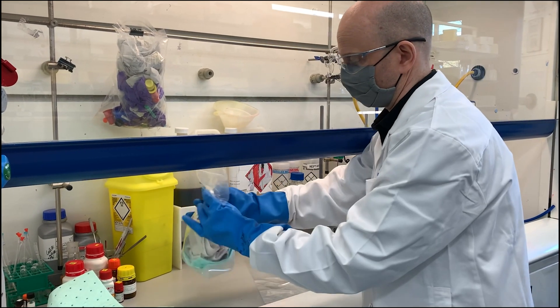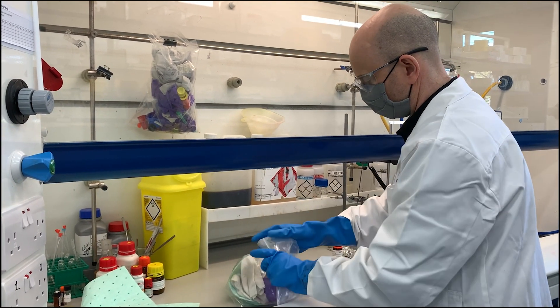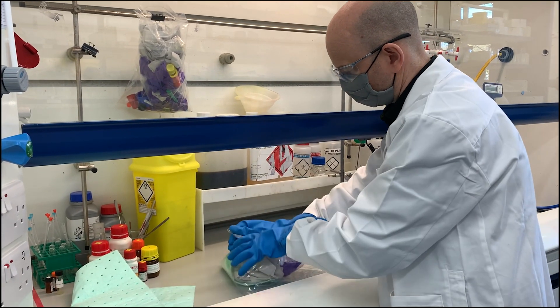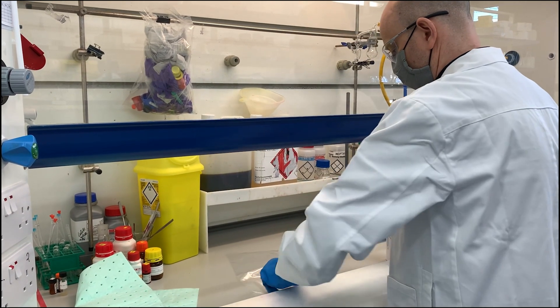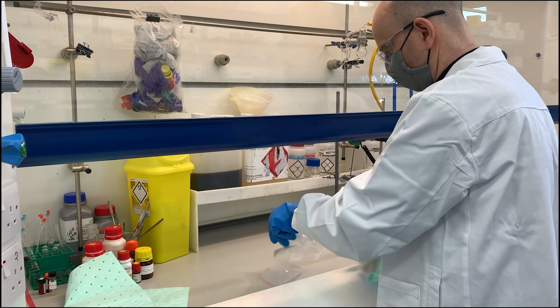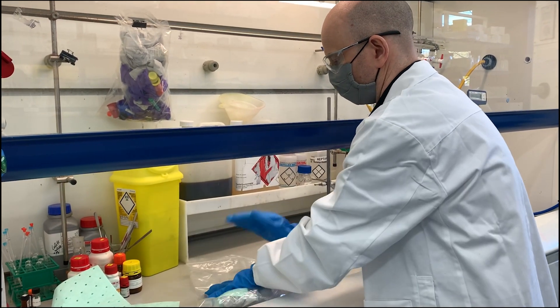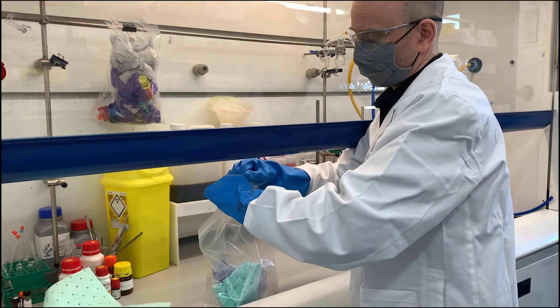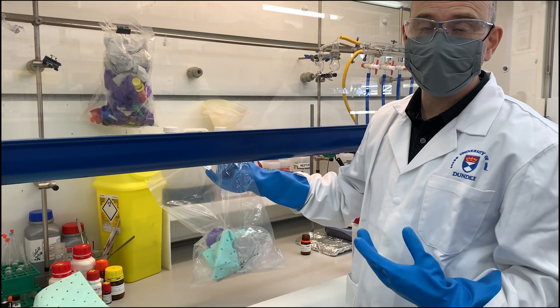This waste bag needs to be double bagged before it can be discarded, so you just need to squeeze out as much air as possible. This reduces the possibility of puncturing while it's in the waste. Now that it's been double bagged, it can go into the standard waste bins.